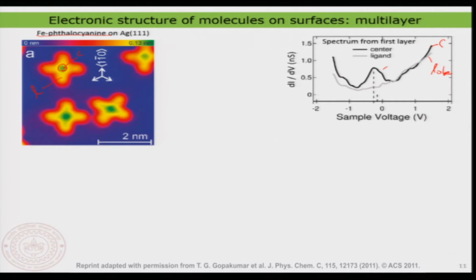But now, when you look at the spectrum, it does not look the same as what we have seen in the previous cases. It looks quite different and has quite some density even in the region around the Fermi level. It also has a very strong state near the Fermi level. So, what is actually happening? This is quite interesting.